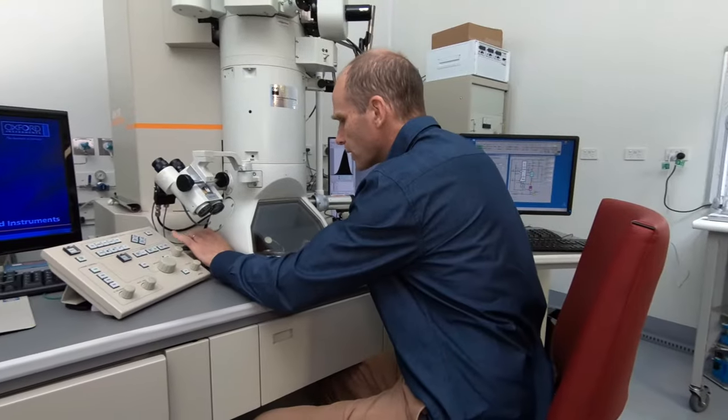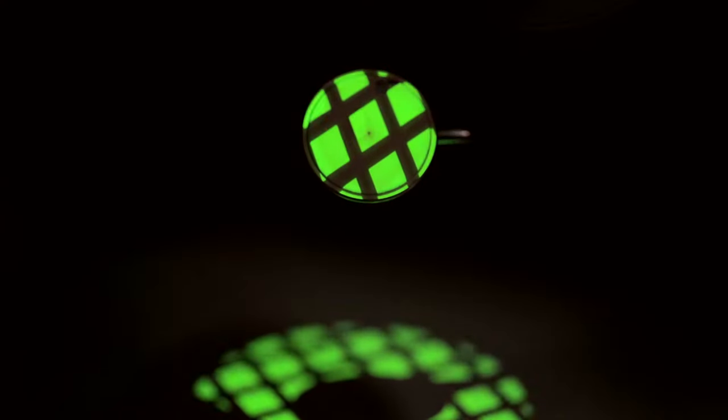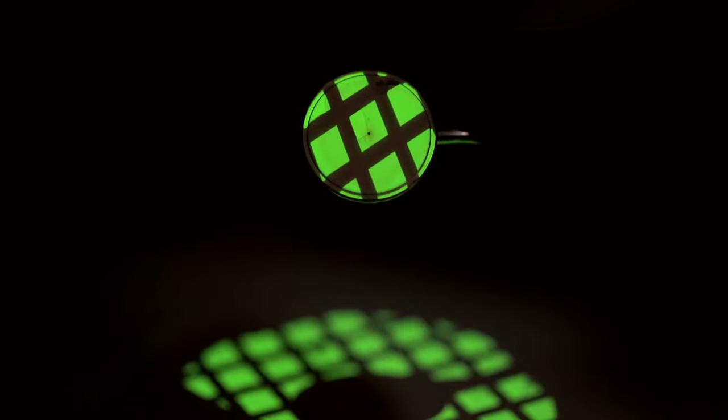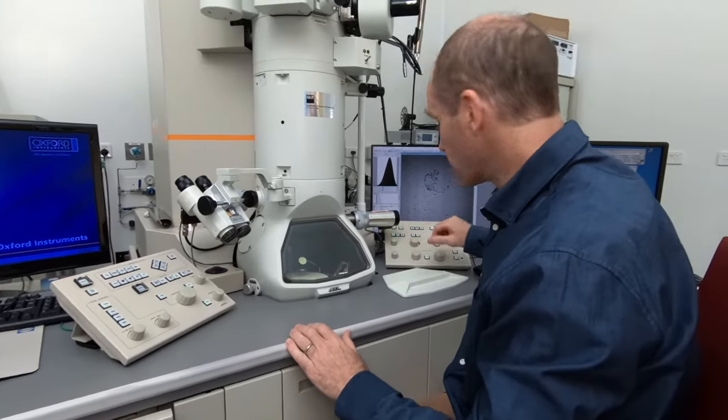And we can look for a suitable square here. This one here looks like it would be nice. And now we can go up and look at this at a higher magnification. And at this point, it's probably worthwhile going and having a look at things on the CCD camera so we can see them in a bit more detail.